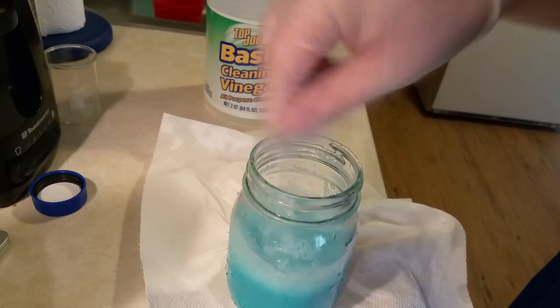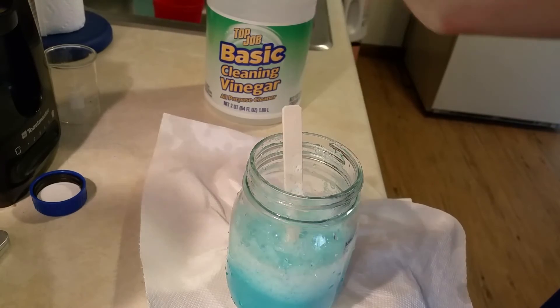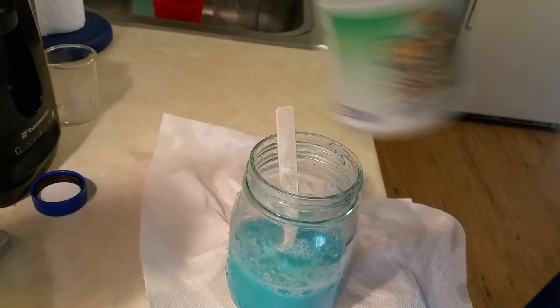You can see that if you stir just the top of the solution and stir the bubbles away, you can control the foaming a lot more easily than if you're stirring the liquid portion of the container.